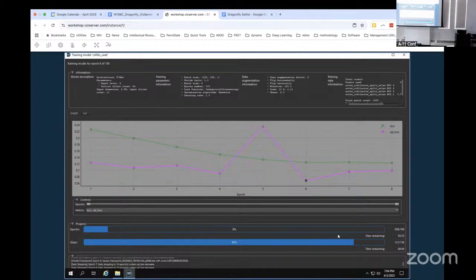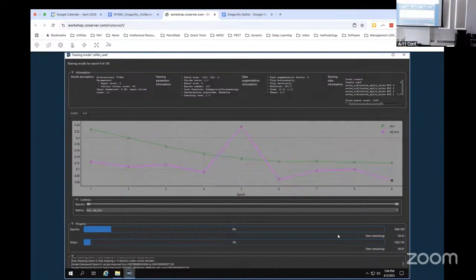The thing is, all of them are labeled final, so I can't find what's the ground truth. When I input them, they all just come in as a file. They're different things, but they're just not labeled. And also none of them look like the right one, because some of them were the ones with the fiducials in them.